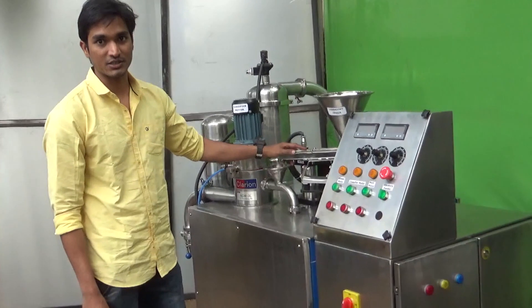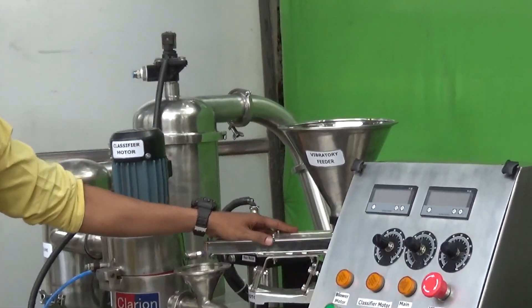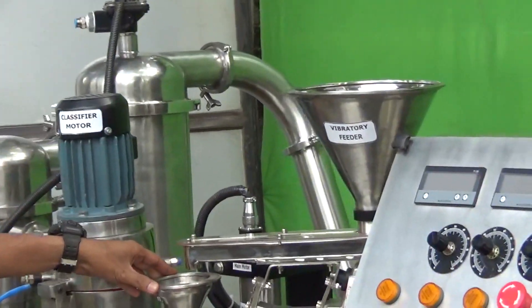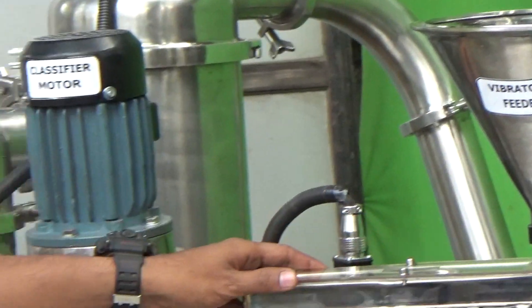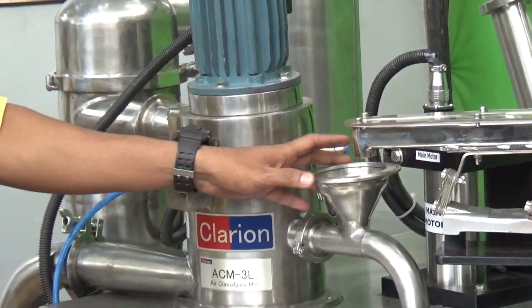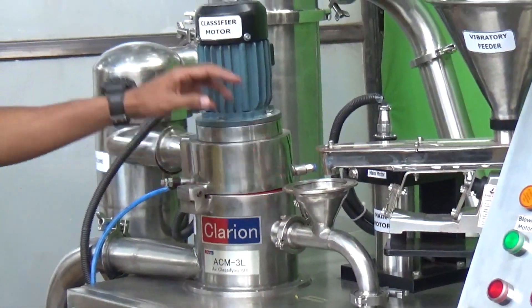The very first component is the vibratory feeder. The material will be delivered to this vibratory hopper, and from this vibratory hopper the material will be delivered to the hopper on a very steady scale. With the vibration effect, the material is delivered steadily. Once the material is delivered to this hopper, it will be delivered to the main mill.